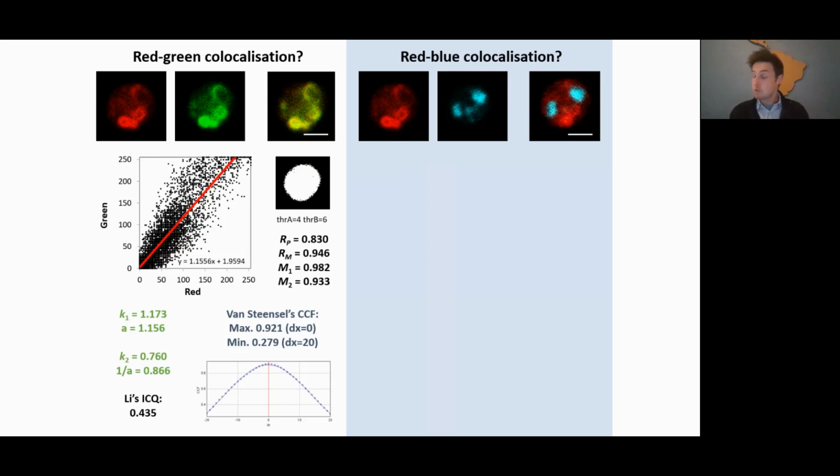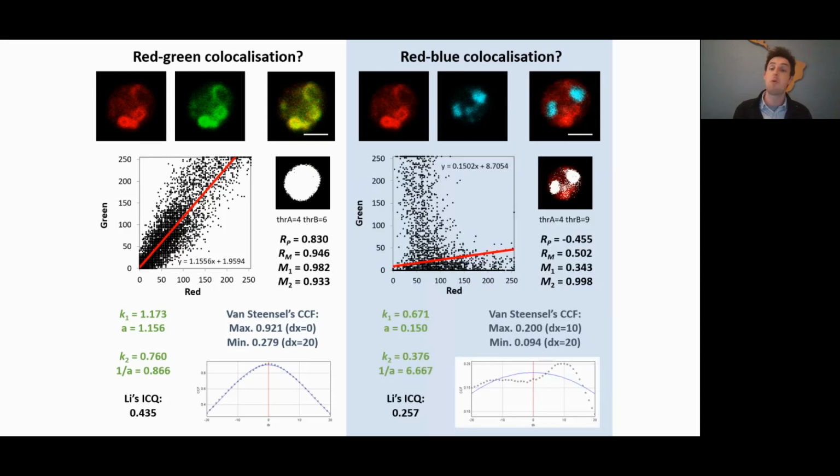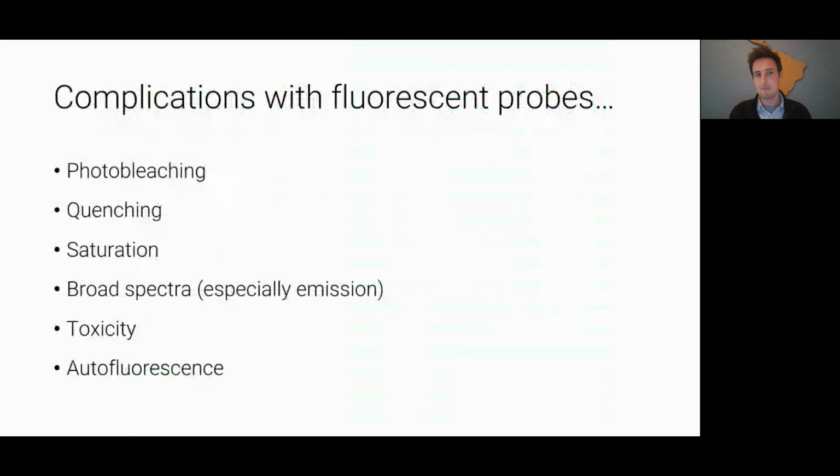And in the same sense, when things don't colocalize, it's important to show quantitatively that that's not the case. It just makes any observations from your microscopy far more representative. It reduces bias because you're necessarily having to do this over a very large sample size, but it's avoiding the subjectivity that might come into the microscopy.